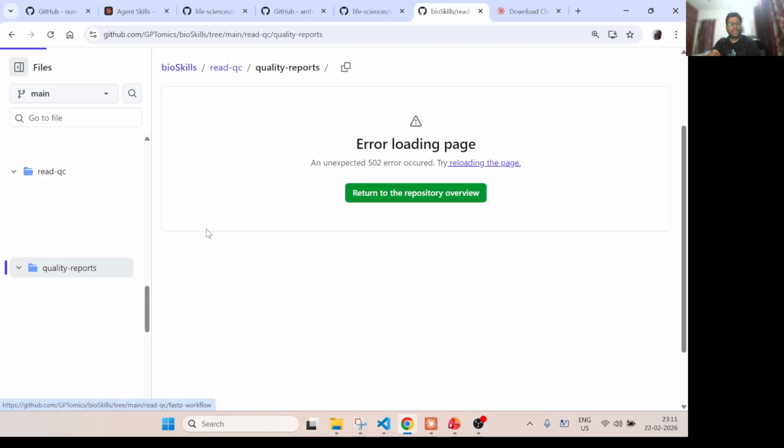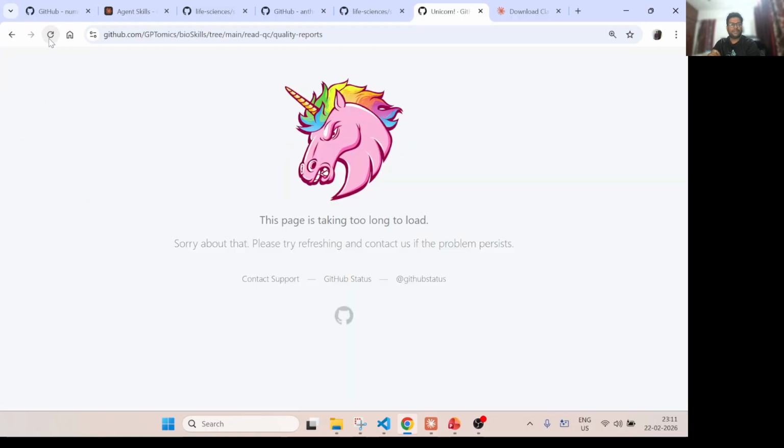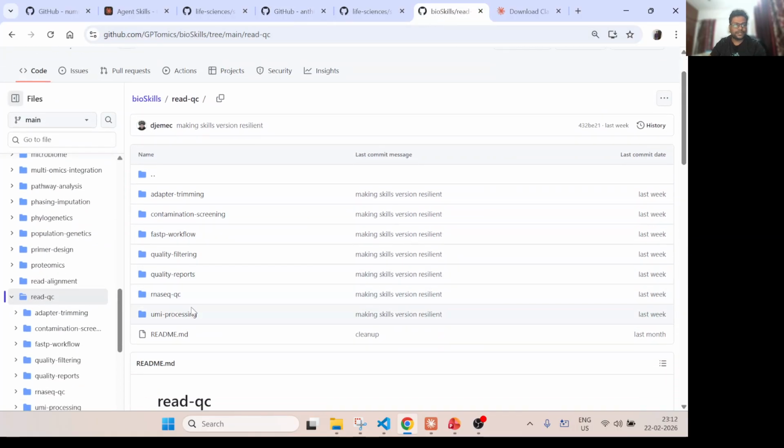So if you go to this quality reports, what happened? Let me refresh it. Something is wrong. Some issue was there. Let me check again.